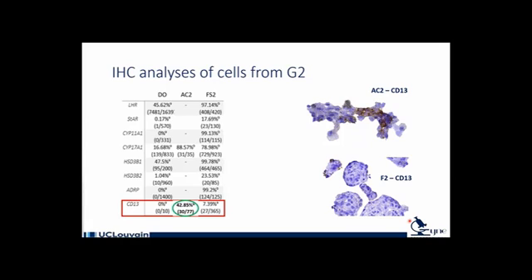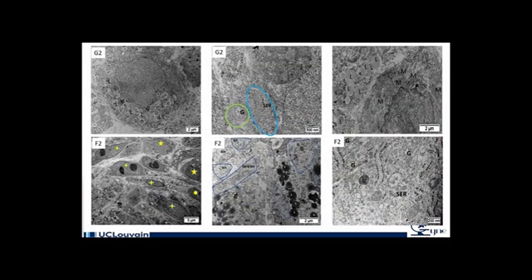So CD13 and CYP17. Our results show that while a significant proportion of attached cells differentiated into theca cells, the proportion of CD13 positive cells from the floating structure was not different from the control. Ultrastructure analysis from G2 evidenced that attached cells had a round, oval, or somewhat undulated nucleus, rough and abundant smooth endoplasmic reticulum, Golgi apparatus, lipid droplets, oval mitochondria with tubular or vesicular crista, and lysosomes, which matches the ultrastructure of human theca cells according to the literature.